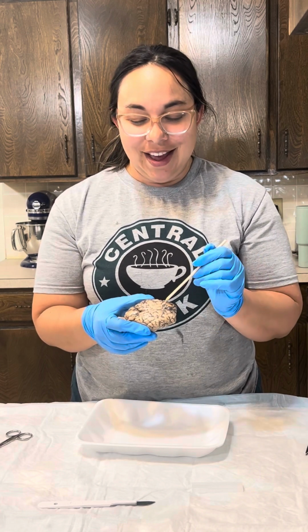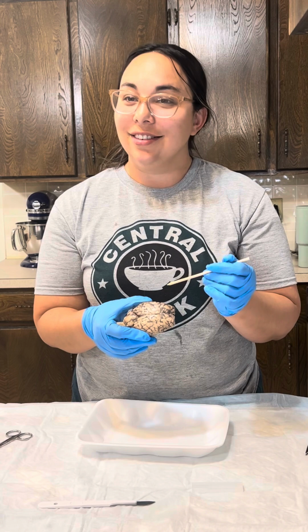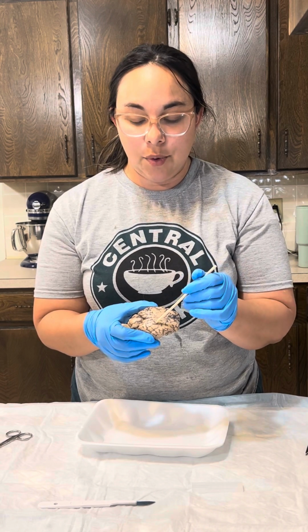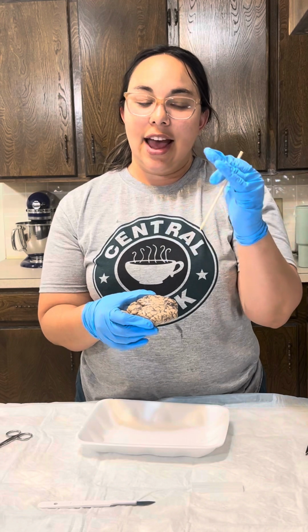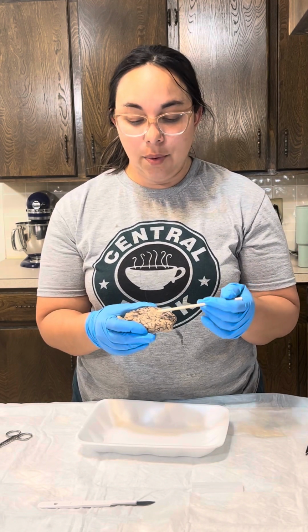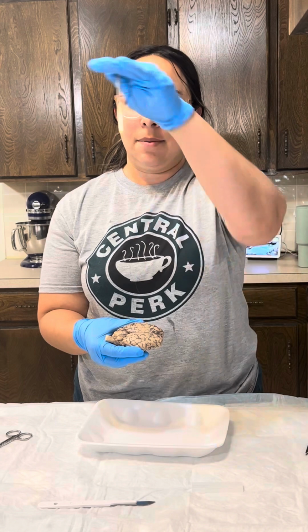And then all these black parts, if it were bigger, fatter, I like that, fatter, all these black parts right here would be actually dips, and those are called sulci. So this middle part right here is just a deeper sulci. It goes deep down and then comes back up, and it separates the left and right hemispheres of the brain.